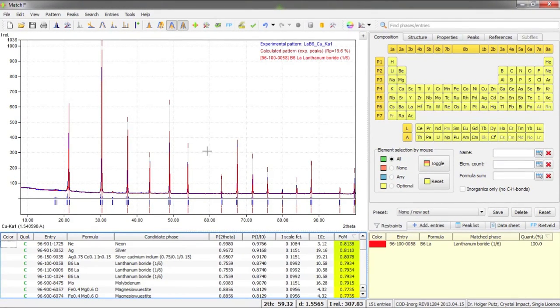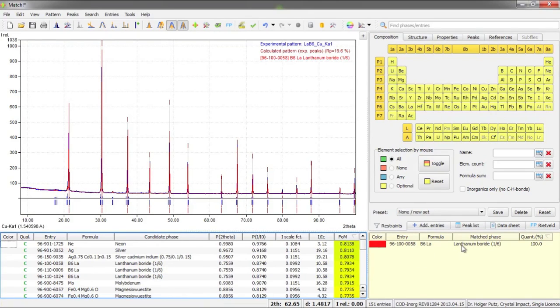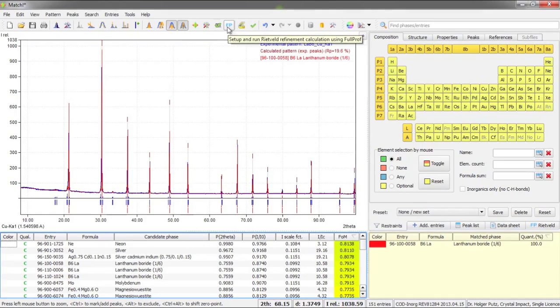Now we have everything we need for the Rietveld refinement. We have the raw diffraction data and we have crystal structure data here from this selected entry. In order to run the Rietveld refinement we can for example press this FP button here.